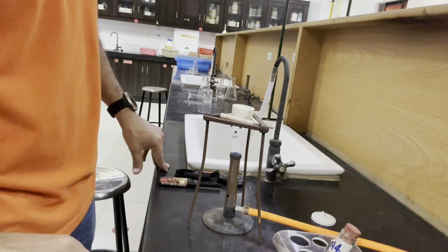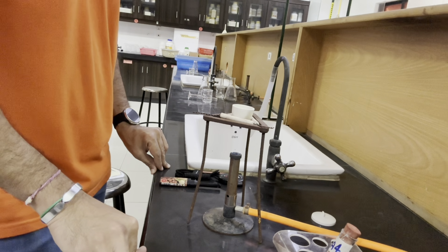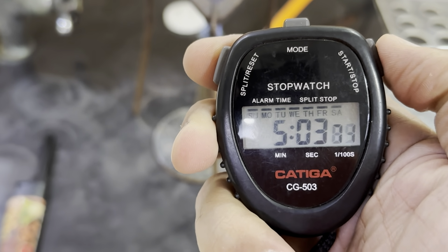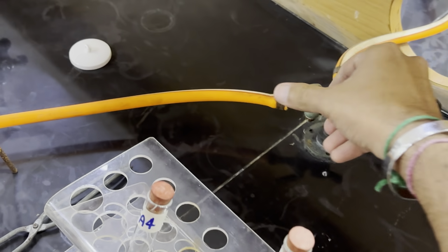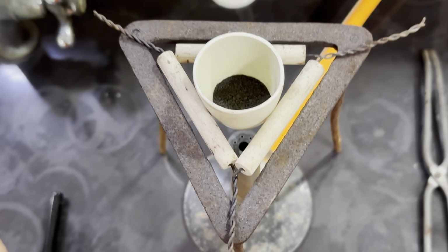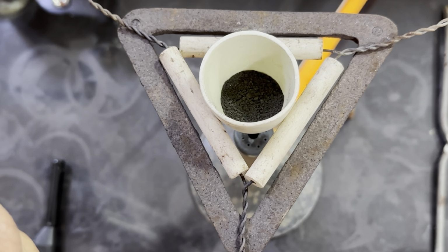It's 1 minute, so we will increase the flame so that crucible is heated from all the sides, which is meant by strong heating. As soon as timer says 5 minutes, we will stop our Bunsen burner flame. And now let's have a look at the appearance. It's totally converted into black solid.